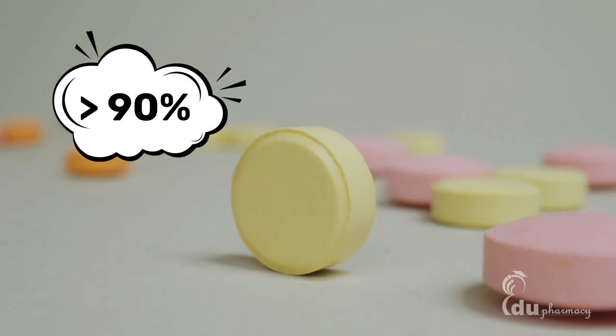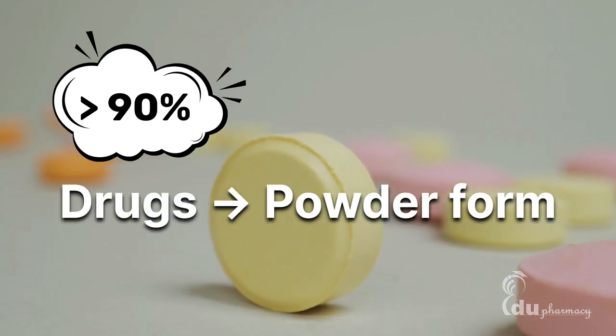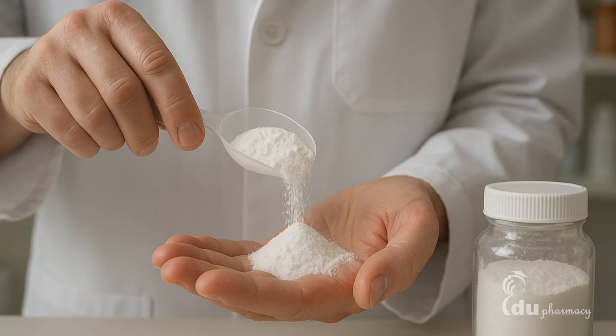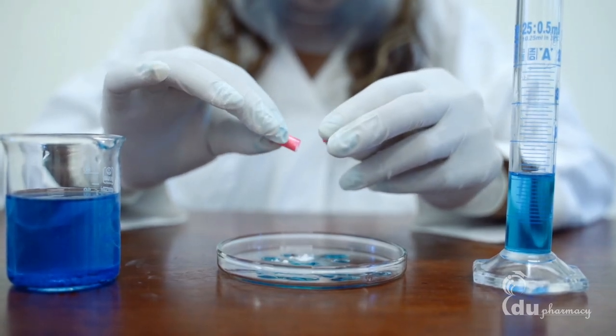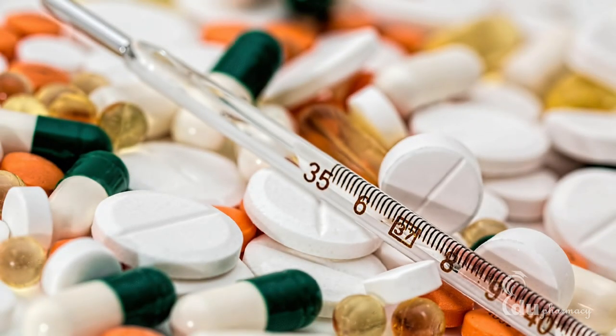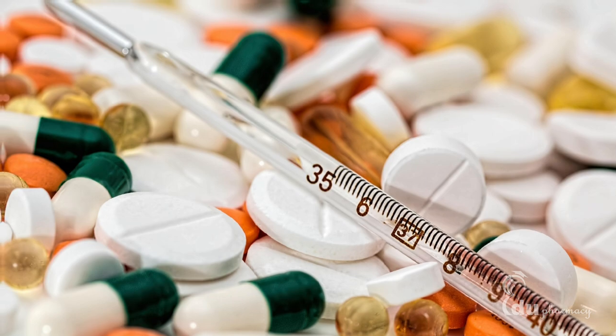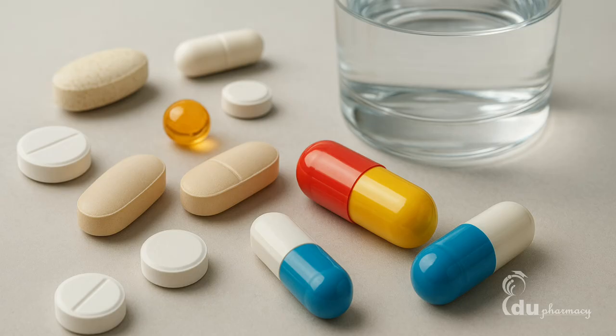More than 90% of drugs are handled in powder form at some stage, whether as raw ingredients, intermediates, or finished products like tablets, capsules, and inhalers. If we don't fully understand how these powders behave, we risk producing medicines that are inconsistent, unstable, or even ineffective. That's why powder characterization is so important. It helps us ensure every single dose of medicine is safe, effective, and of the highest quality.